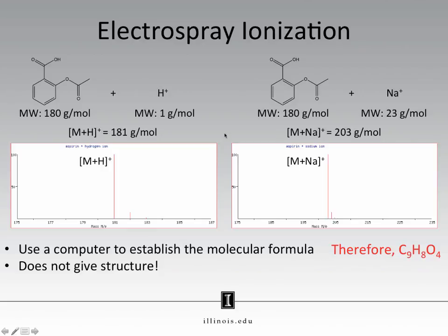Some things to keep in mind. Be on the lookout for M plus H and M plus sodium. In mass spectroscopy experiments, you might see one, you might see the other, you might see both of them. Be aware of that if asked to interpret mass spectra.